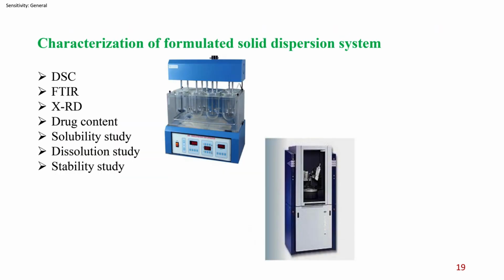Moving further, for the characterization of the formulation of solid dispersion, the methods which we took were DSC, FTIR, XRD, drug content, solubility study, dissolution study, and stability study.